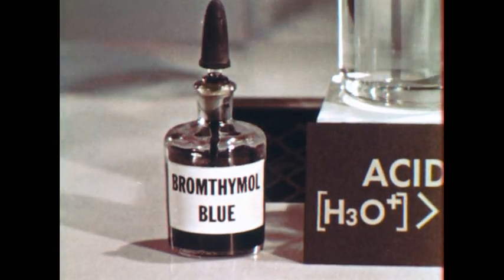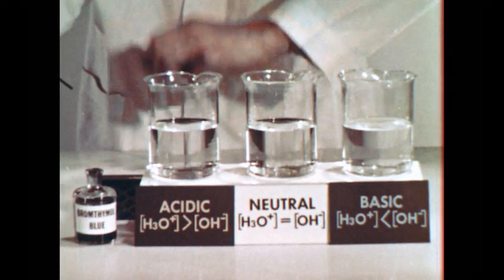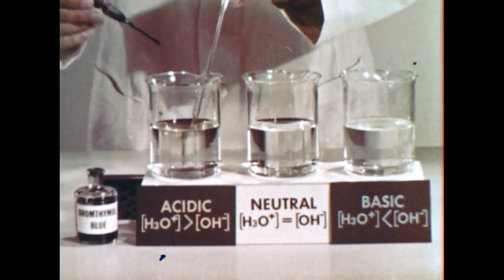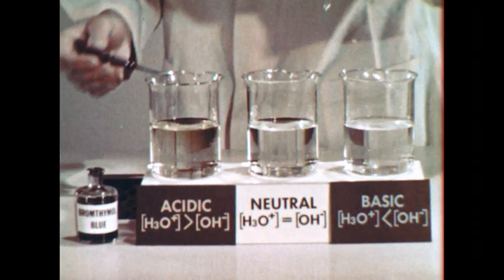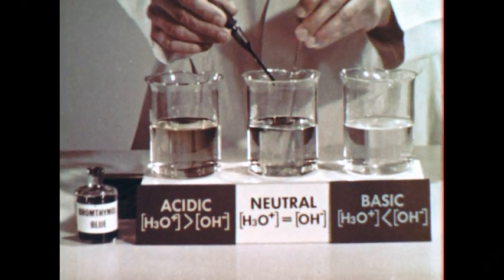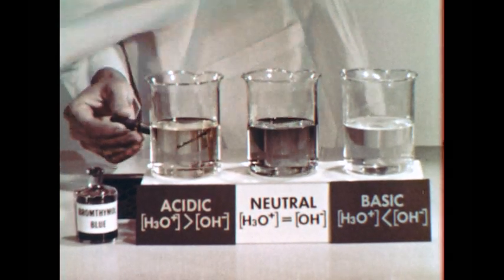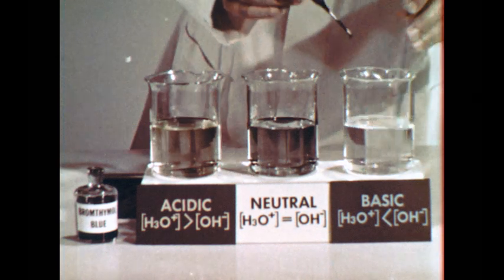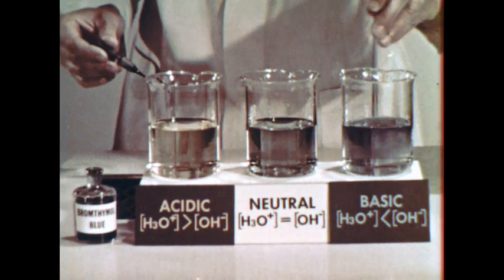Now let's add some of the indicator bromothymol blue to our solution. We see that the indicator is yellow in the acidic solution. The indicator is blue in the basic solution and an intermediate color in neutral water.